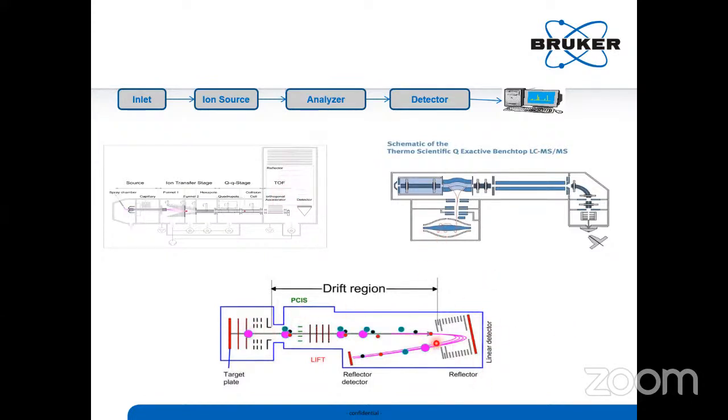The third system here is MALDI-TOF technology. What is the difference between Q-TOF and MALDI-TOF? The term itself, you can mention it as MALDI-TOF. In Q-TOF, you have filtration, collision cell, and TOF technology in different compartments. And as I always mention, at the entrance in the spray chamber, you can connect LC, GC, CE, all other equipment. But in MALDI-TOF technology, MALDI means matrix assisted laser desorption ionization. Here it is ESI, electrospray ionization. There it is laser desorption ionization.